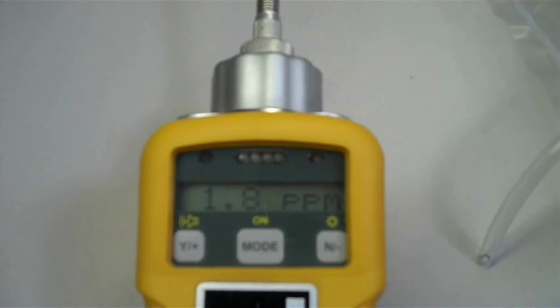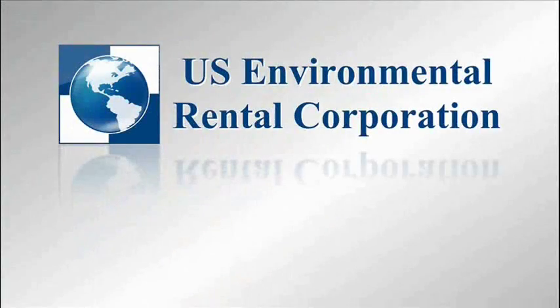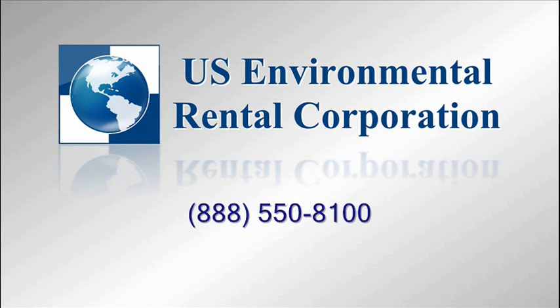This completes the calibration of the Mini Ray 2000. Remember, if you have any questions regarding this or any other project, a knowledgeable and experienced U.S. environmental associate is ready to assist you.